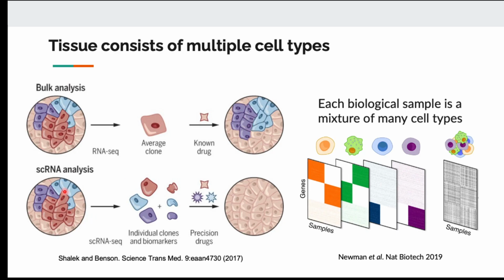The first technique we are talking about today is called the single cell technique. SC here is single cell. We're going to see an approach where we isolate all the individual cells out from the tissues and analyze each of them separately. So we get information about the gene expression profile or the mutation profile for individual cells. We know how many cells are there in the sample and what type of cells are there.